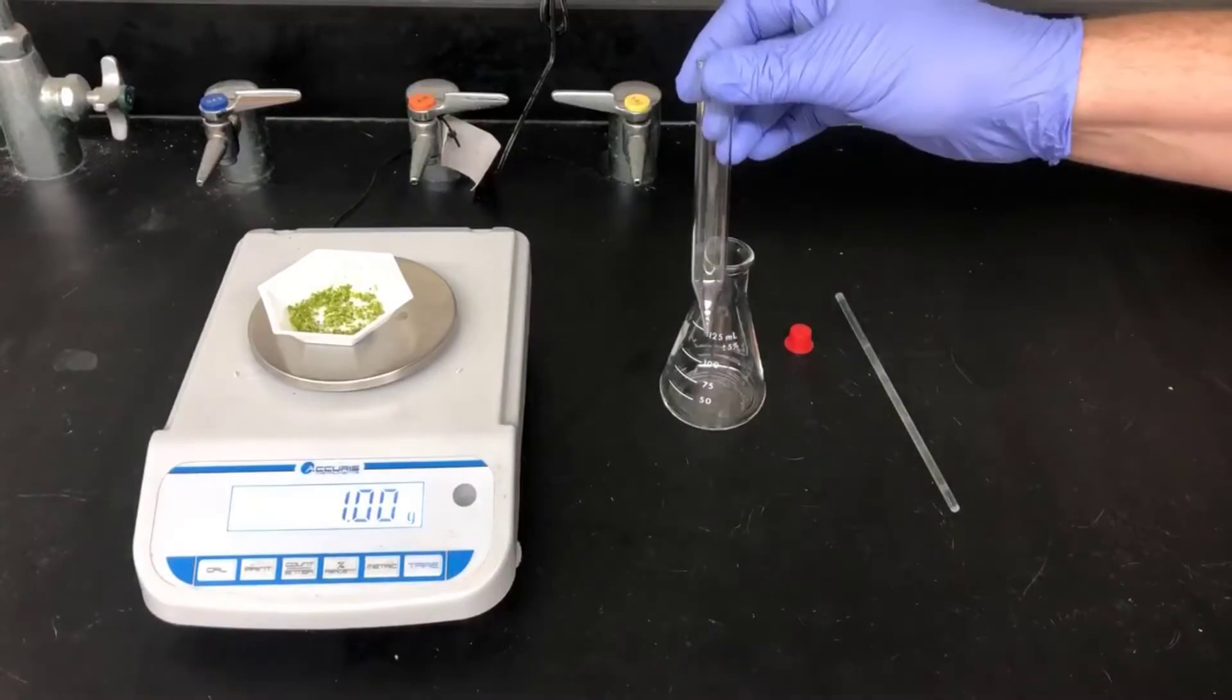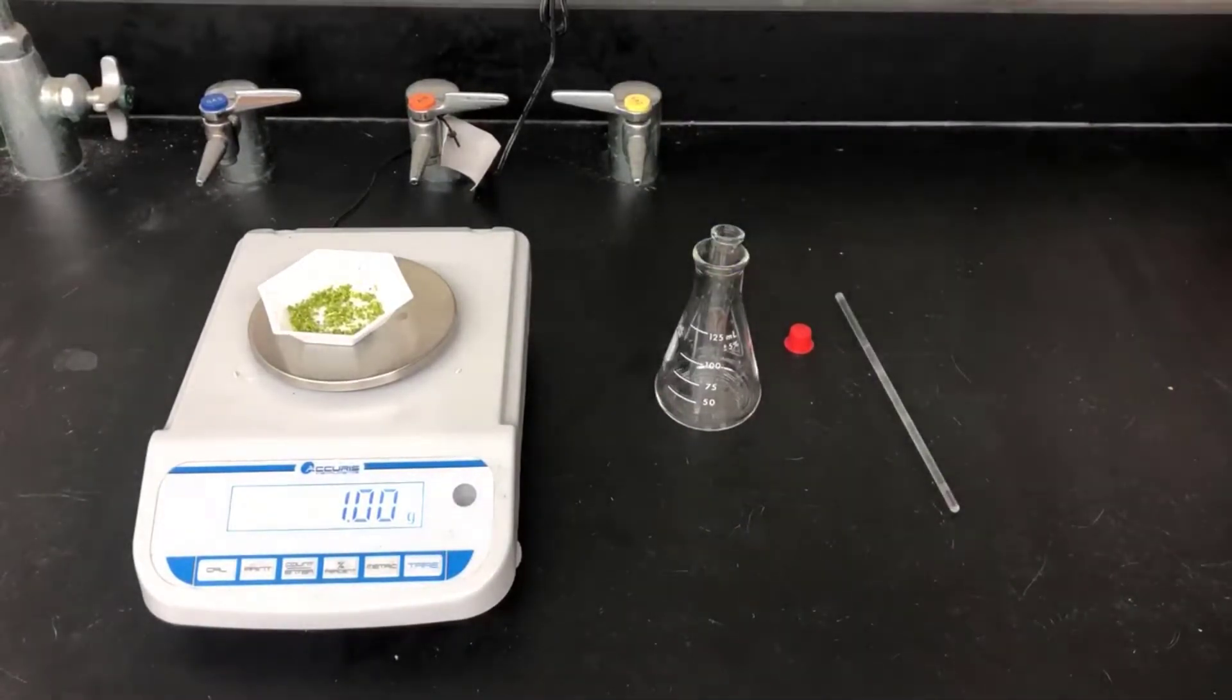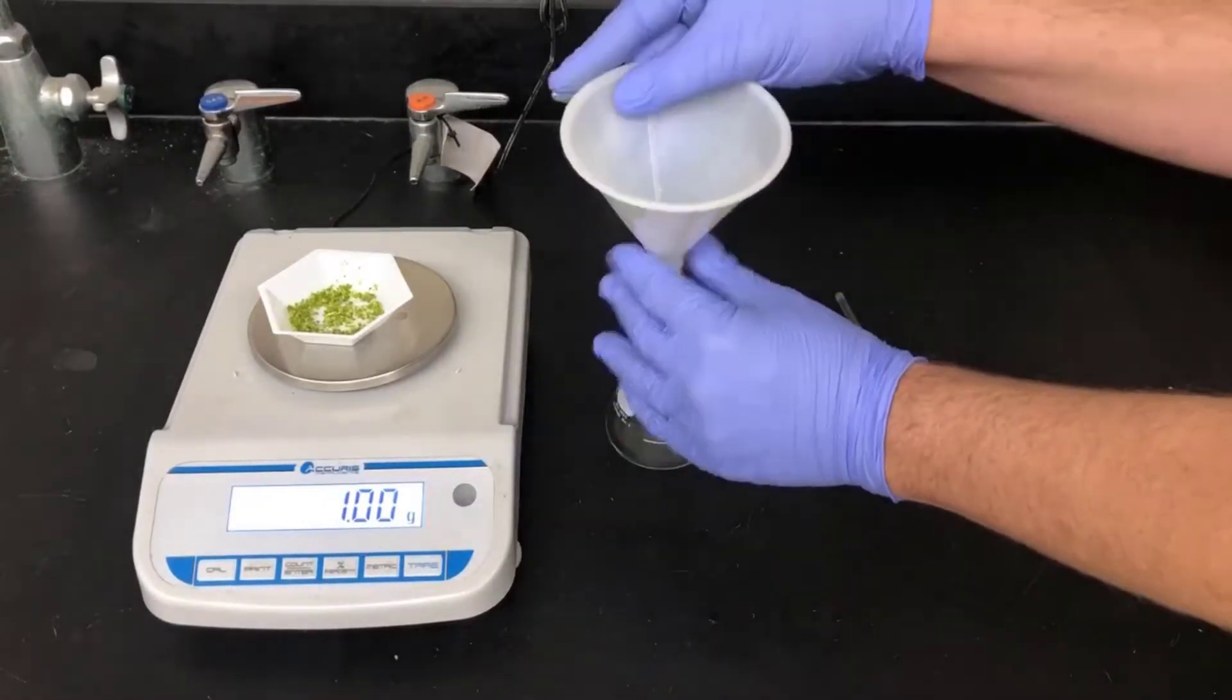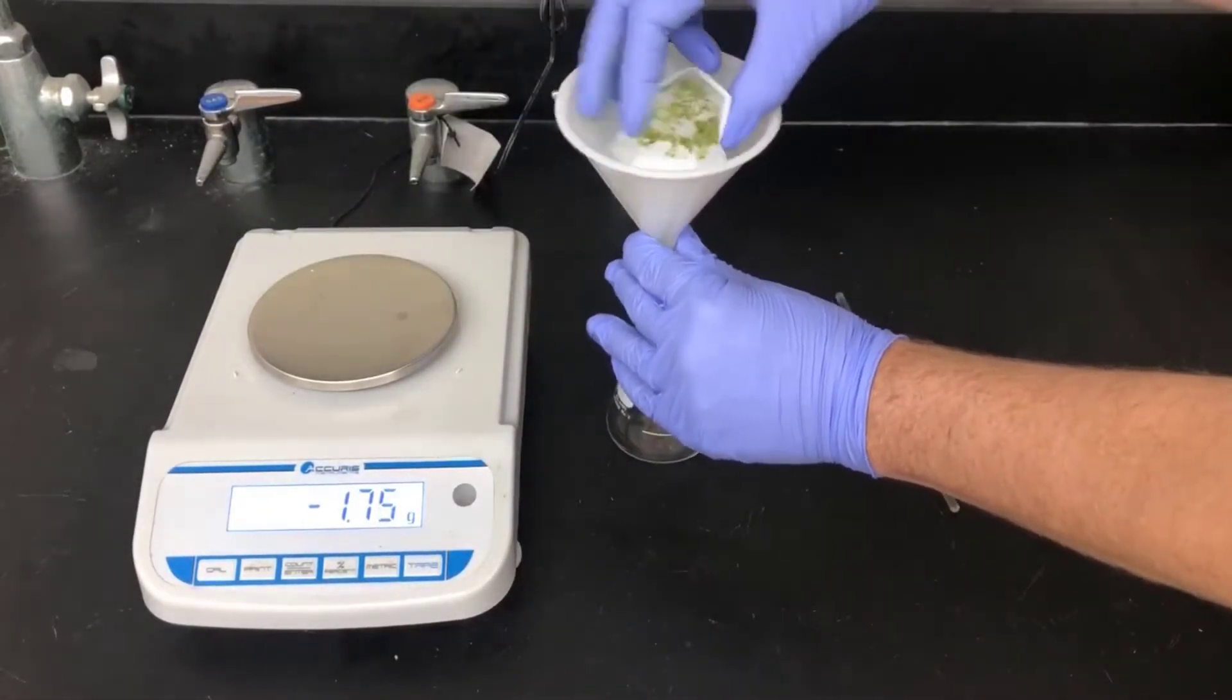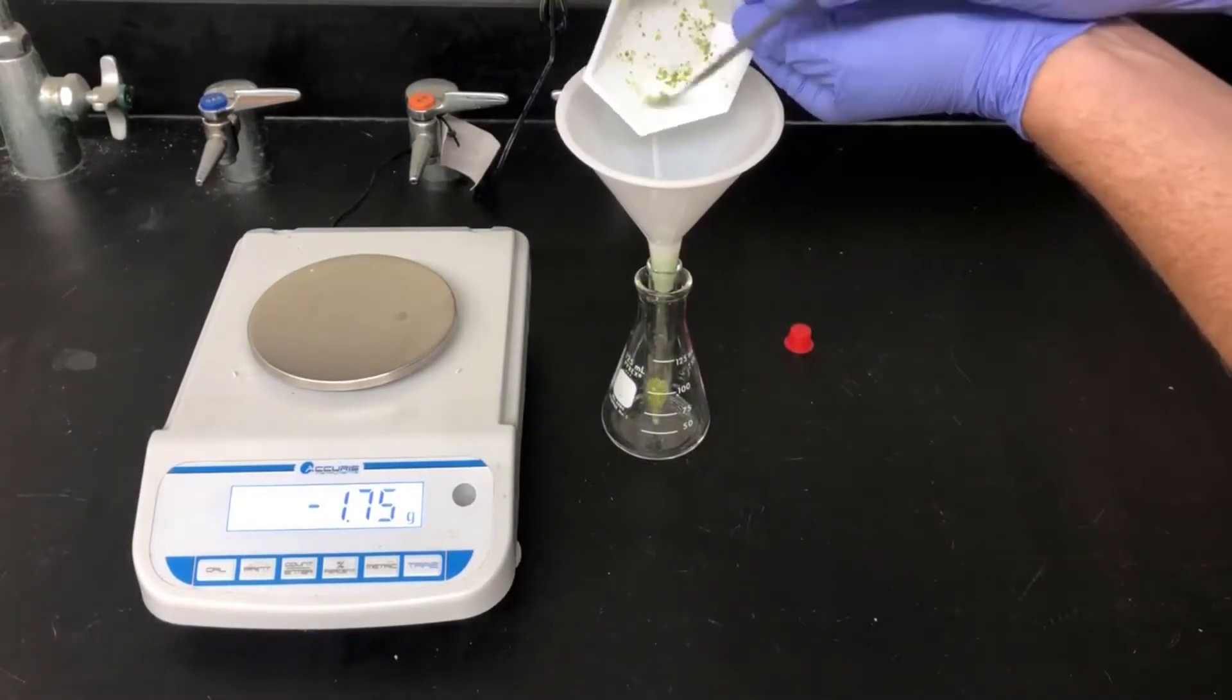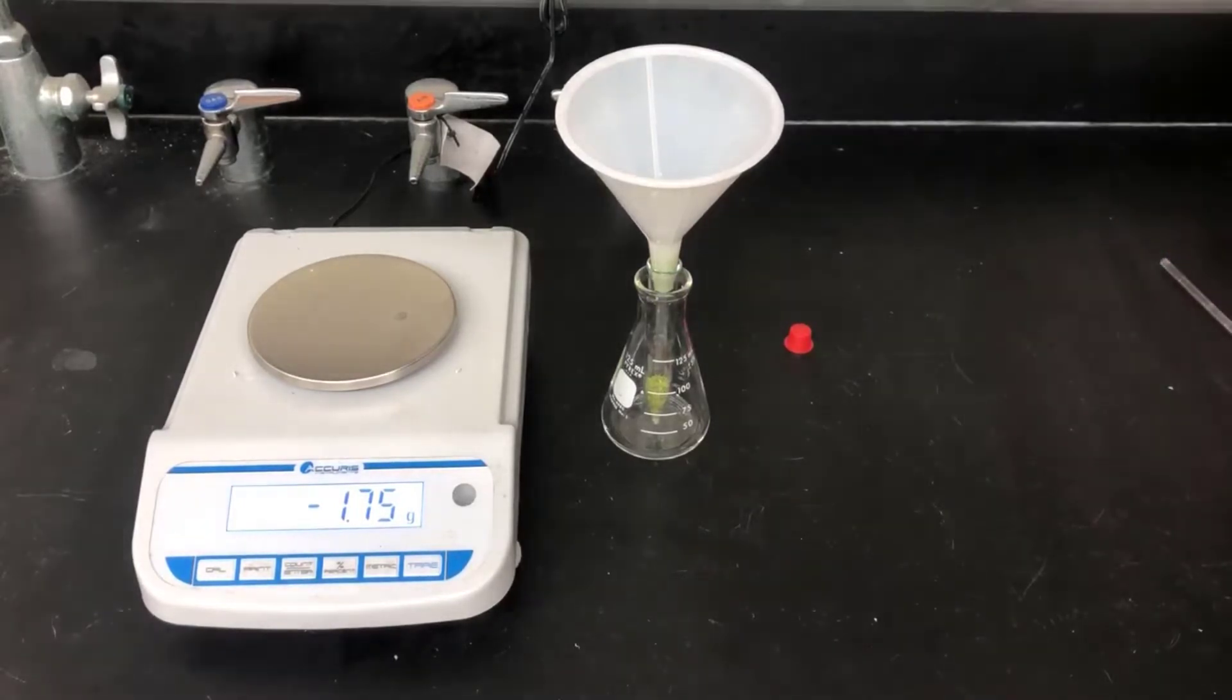I'll be using this point bottom centrifuge tube to do the extraction today. The next thing will be to get the lime zest into this tube. I've got a funnel here that'll work well for demonstration purposes. You don't necessarily need a funnel. You can scrape it in with a spatula. It just takes a little bit longer. Whatever method you'd like to use, just get the lime zest into the test tube.